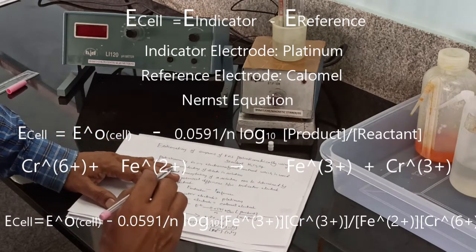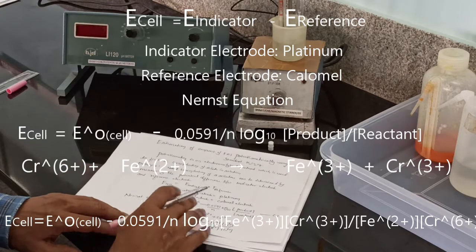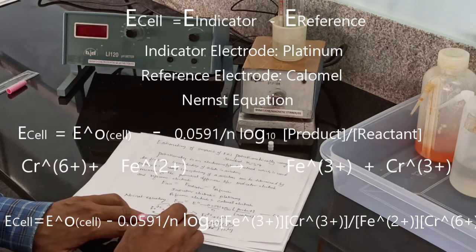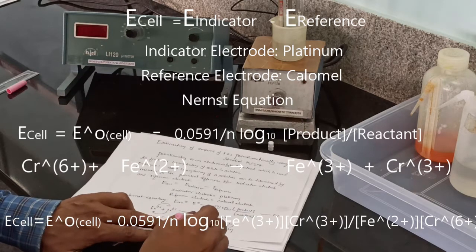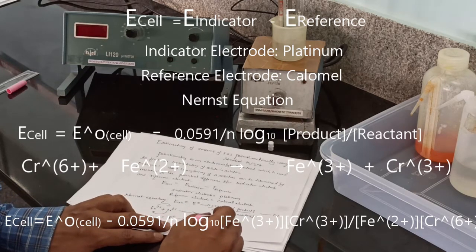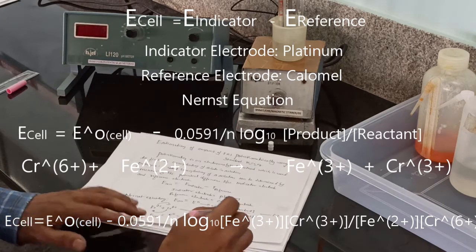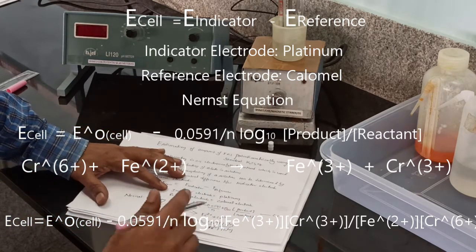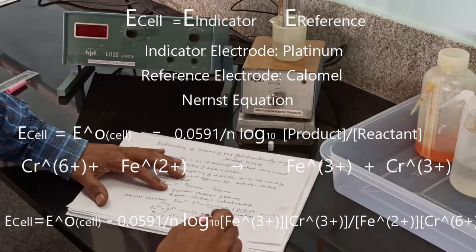If you write the Nernst equation for this reaction, we will get E cell equals E naught minus 0.0591 divided by n into log base 10 of the concentration of Fe3 plus by concentration of Fe2 plus into concentration of Cr3 plus divided by concentration of Cr6 plus. In the beginning, the EMF of the cell changes gradually due to change in the ratio of concentration of Fe3 plus by concentration of Fe2 plus.